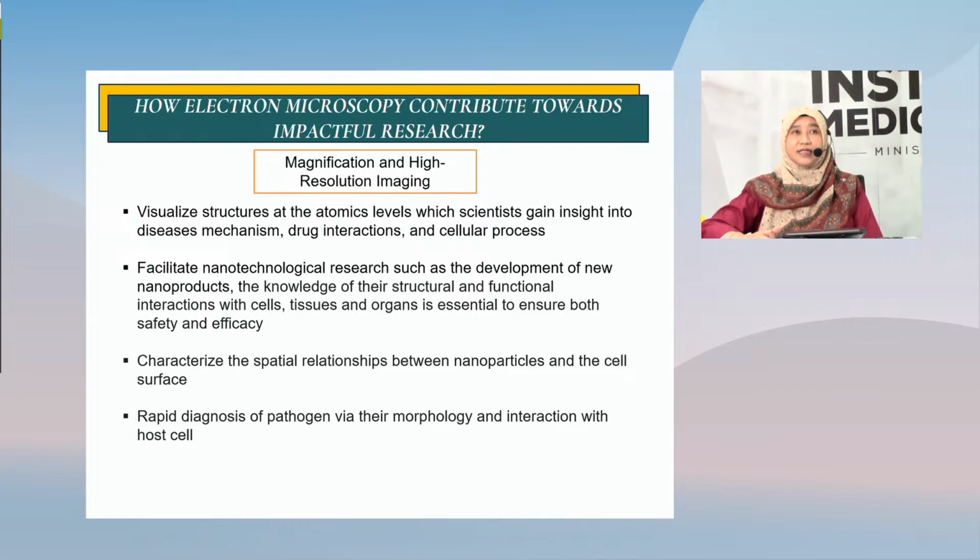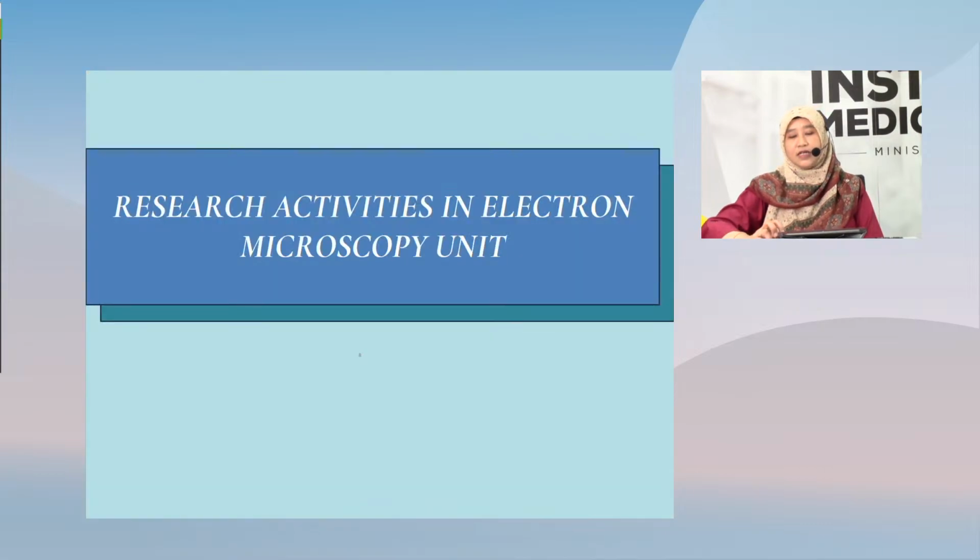Scientists then gain insight into disease mechanisms, and this detailed imaging also facilitates nanotechnological research, such as the development of new nanoproducts, where knowledge of their structure is very important to ensure both the safety and efficacy of the product, and to characterize the spatial relationship between the nanoparticles and the cell surface. It is also very important for rapid diagnosis of pathogens via their morphology and their interactions with the host cell.